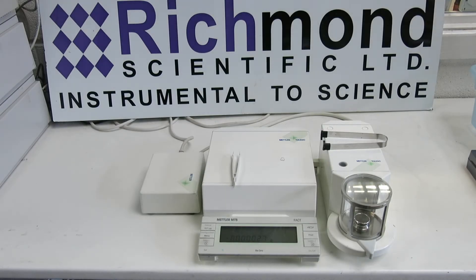This is Nick Edmond, Richmond Scientific. This is a Mettler MT5 microbalance. I'm going to go through the procedure.